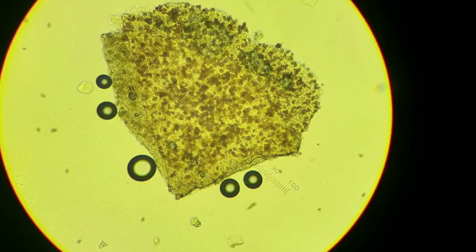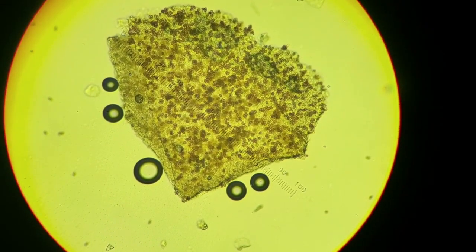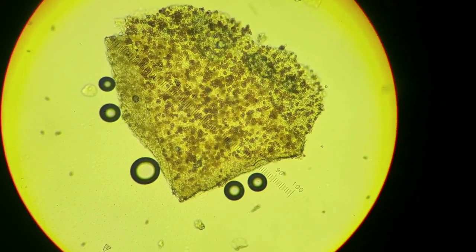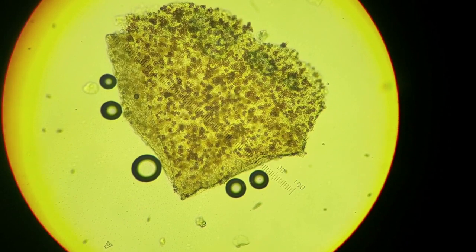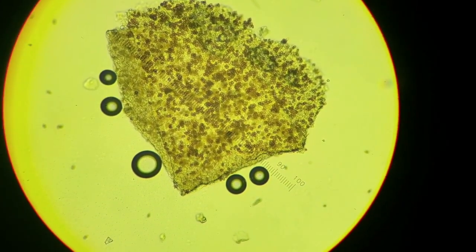So here is a gill that I just cut and threw right onto the slide. And as you can see, it was a much more mature specimen than the first one I tried. And so let's go to oil immersion and see how we can measure these spores and really understand what lateral view means.